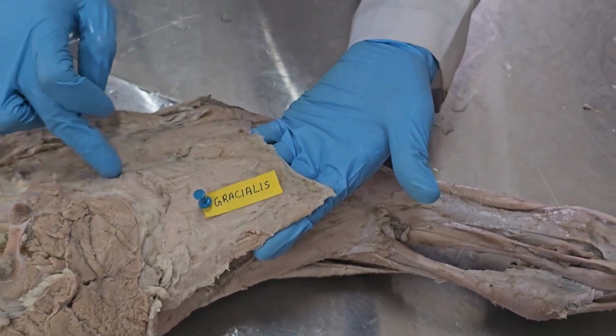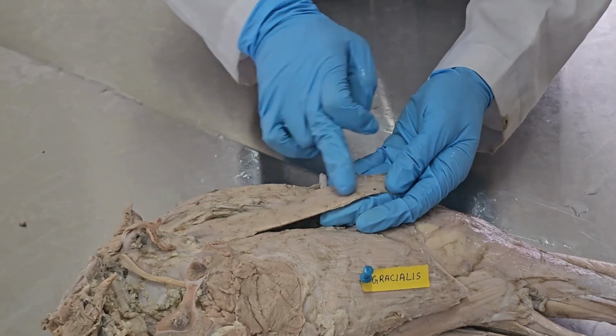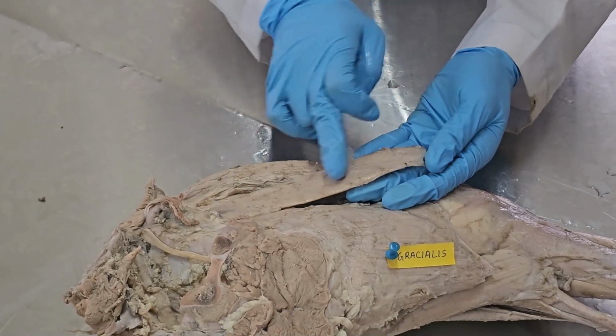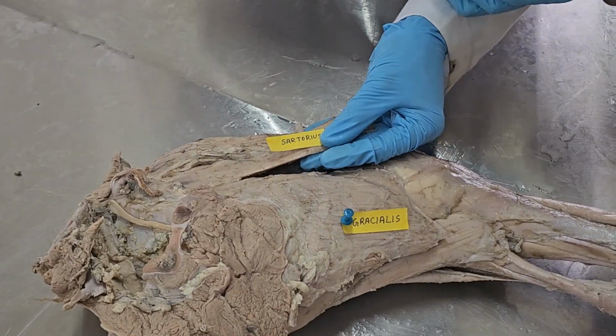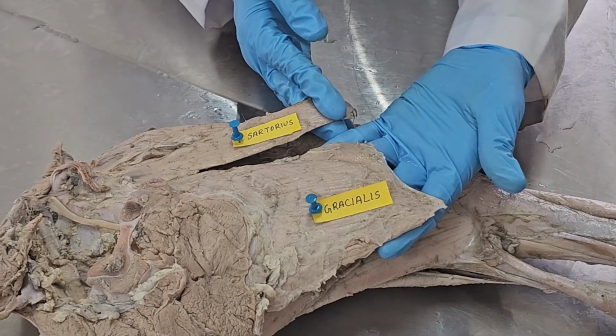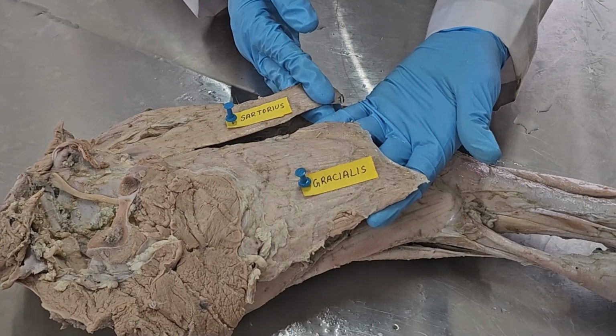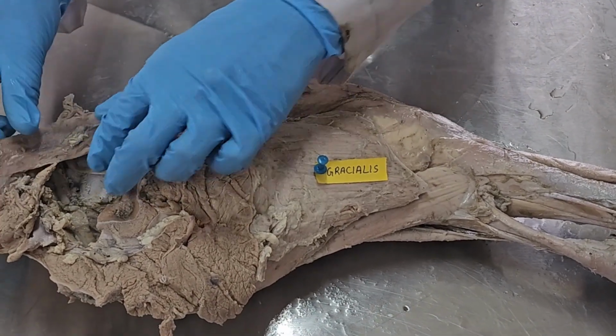Then another muscle here, you can see a ribbon-like muscle. It is called sartorius muscle. So gracilis and sartorius are the superficial layer muscles. Now if you reflect back these 2 muscles.